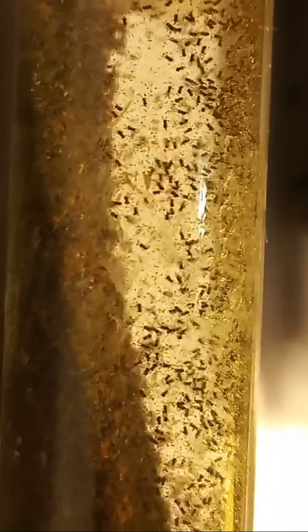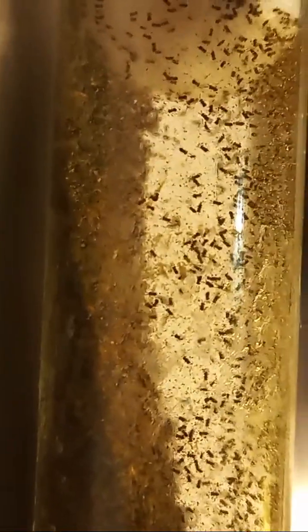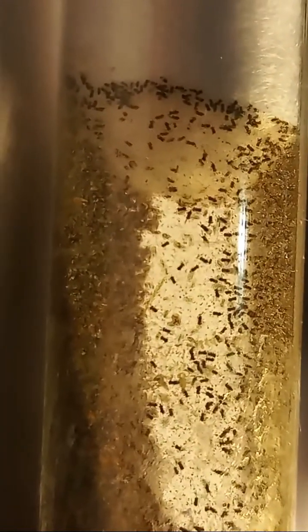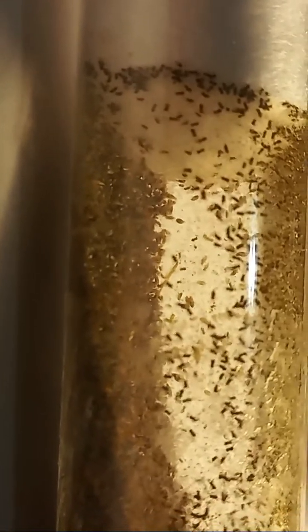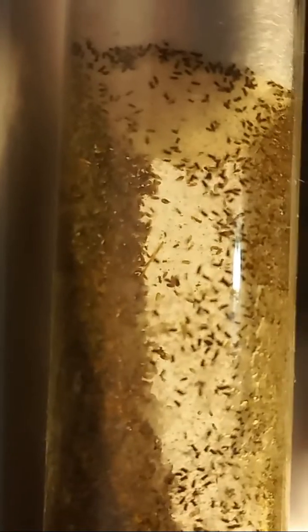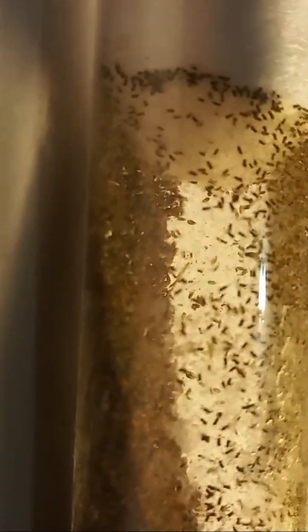But here in a glass tube I can show you all of them together, thousands of them, despite the dirty surface of the glass because of their pee and poo. Nevertheless, you can recognize so many of them because they are tiny, half a millimeter in size, as I said.